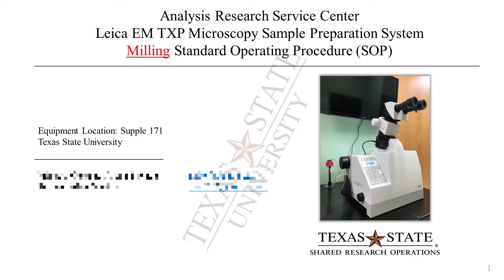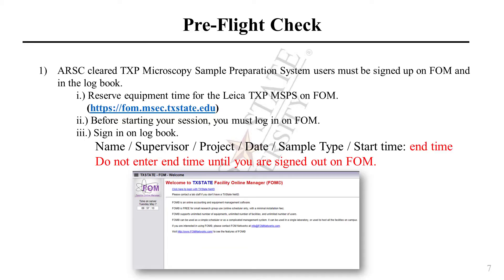Welcome to the ARSC Leica TXP Microscopy Sample Preparation Milling SOP. This video is based on the Leica model EM TXP and only incorporates the tungsten carbide milling procedure. All ARSC policies and procedures apply. Please see the TXP Microscopy Sample Preparation System Standard Operating Procedures for the full protocol.